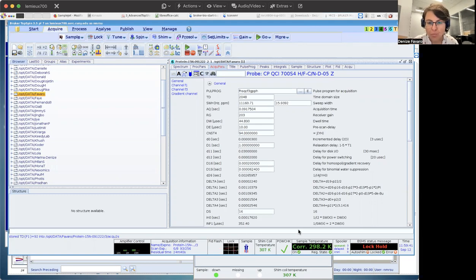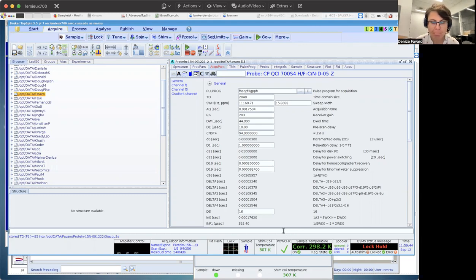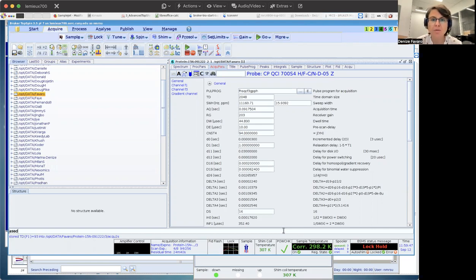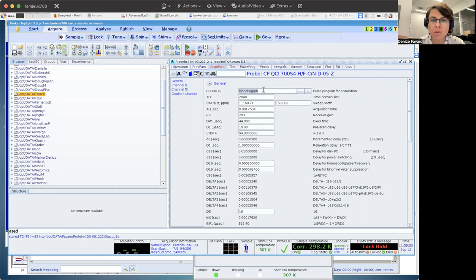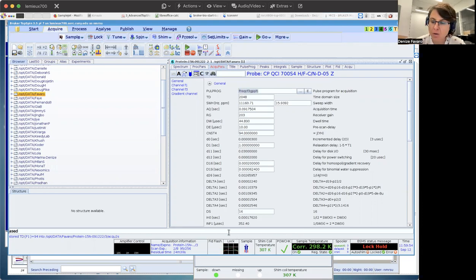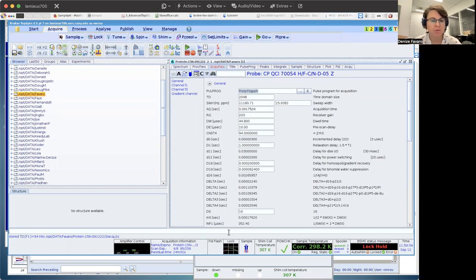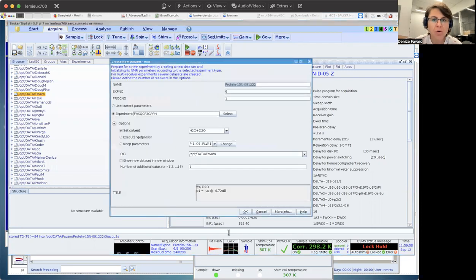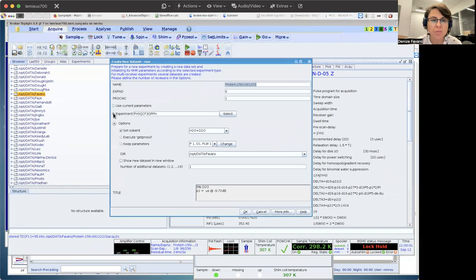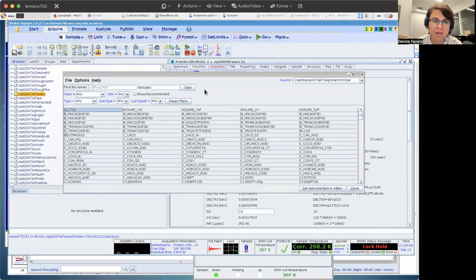Something that I did here, you see that I picked up my whole sequence. One way you can do that, you can either come from another folder that you had run an experiment, or you can come here and select experiment, and you go to select.